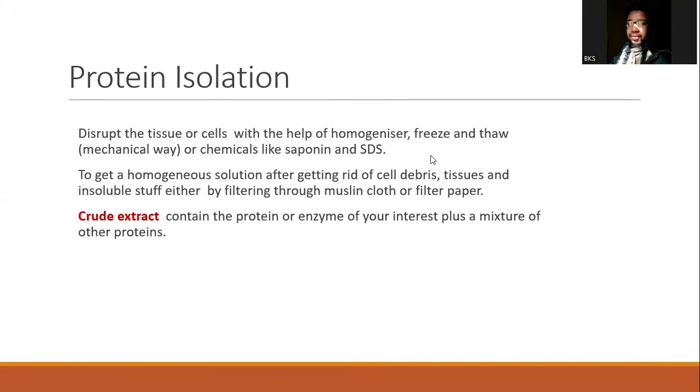Hi, good day, everyone. In this short video, I'll be talking about isolation of protein. How do we isolate a protein from a cell and purify it? Now, it depends on the cell we want to isolate a protein from. Which cell? It's a cell from a prokaryotic organism or a cell from a eukaryotic organism.